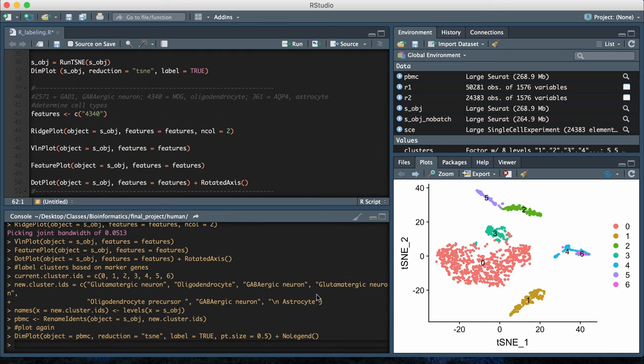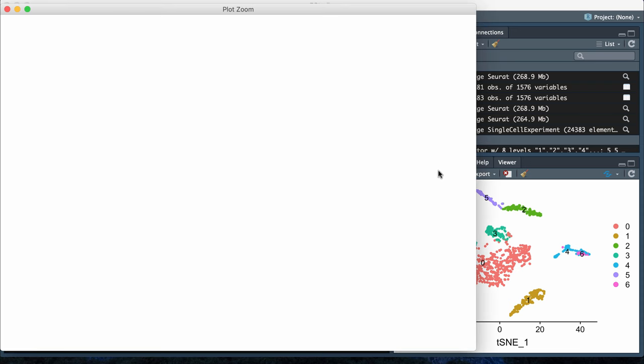Hey guys, in this video I wanted to go over one aspect of doing single-cell RNA-seq analysis, which is cluster labeling.